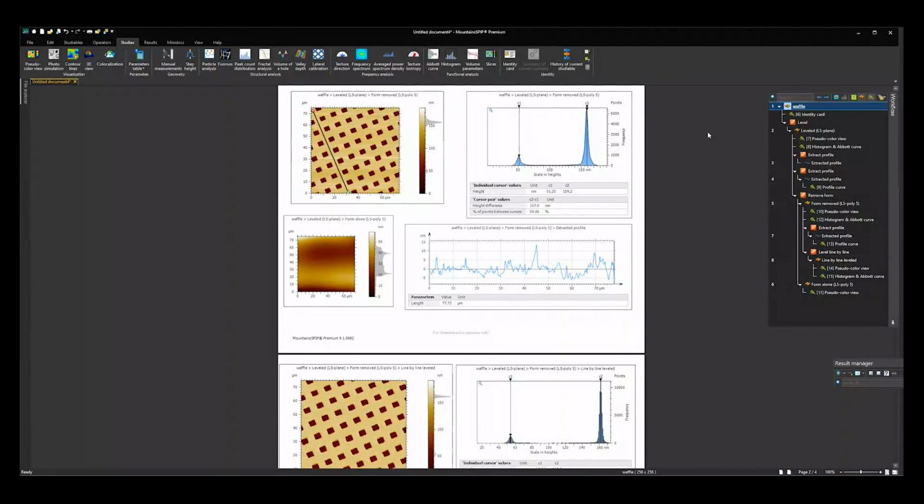But this concludes the image processing section of the master class. And again, we just went over some of the most common tools available for analysis, which were visualization, adjusting the Z-scale and offset, cross-sectional profiles, histograms, 3D analysis, and then the very important processing of plane fitting and line fitting.